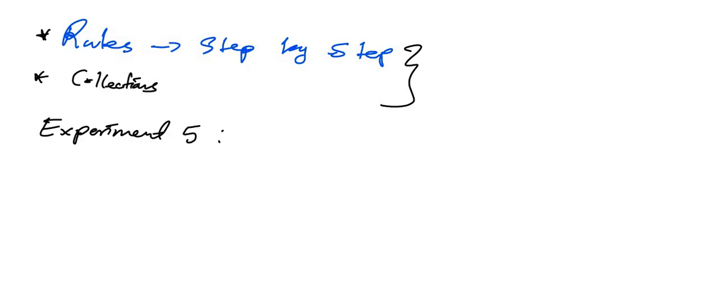That's the rules, the apparatus. They will tell you what to collect, what to mix, and how to mix. So like in experiment number 5, I'll use the discussion there, the materials, the chemicals, and the procedure which was given. They said standardized hydrogen chloride. So I'm using experiment number 5.